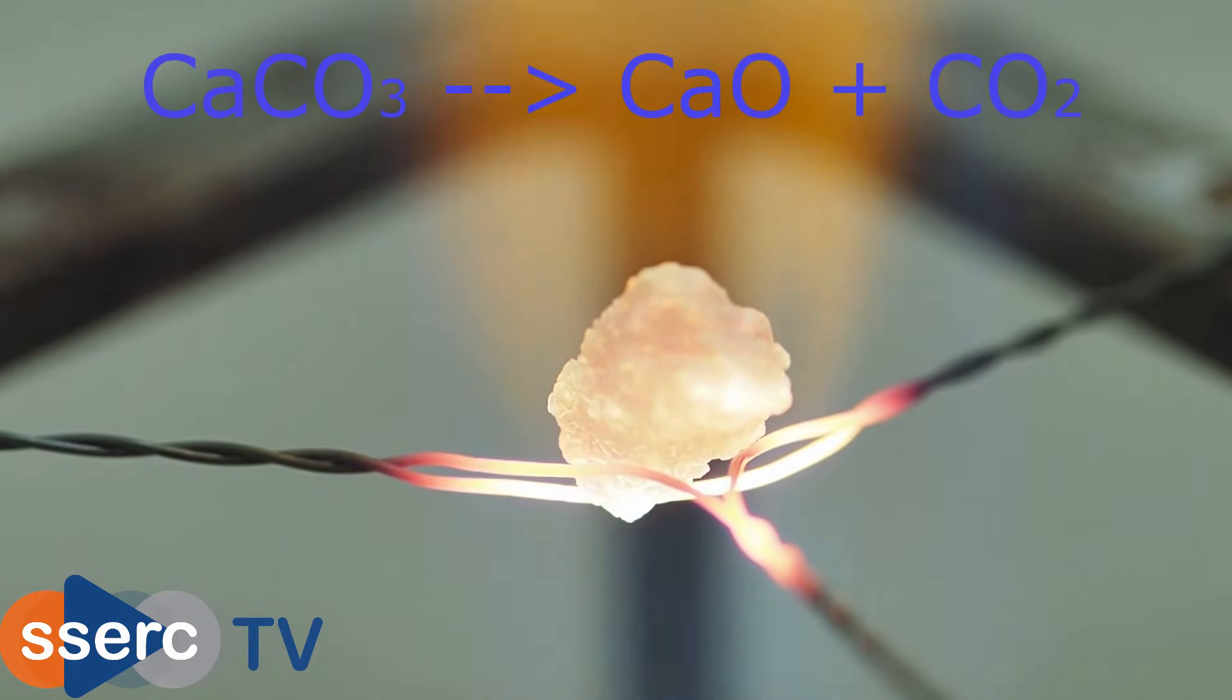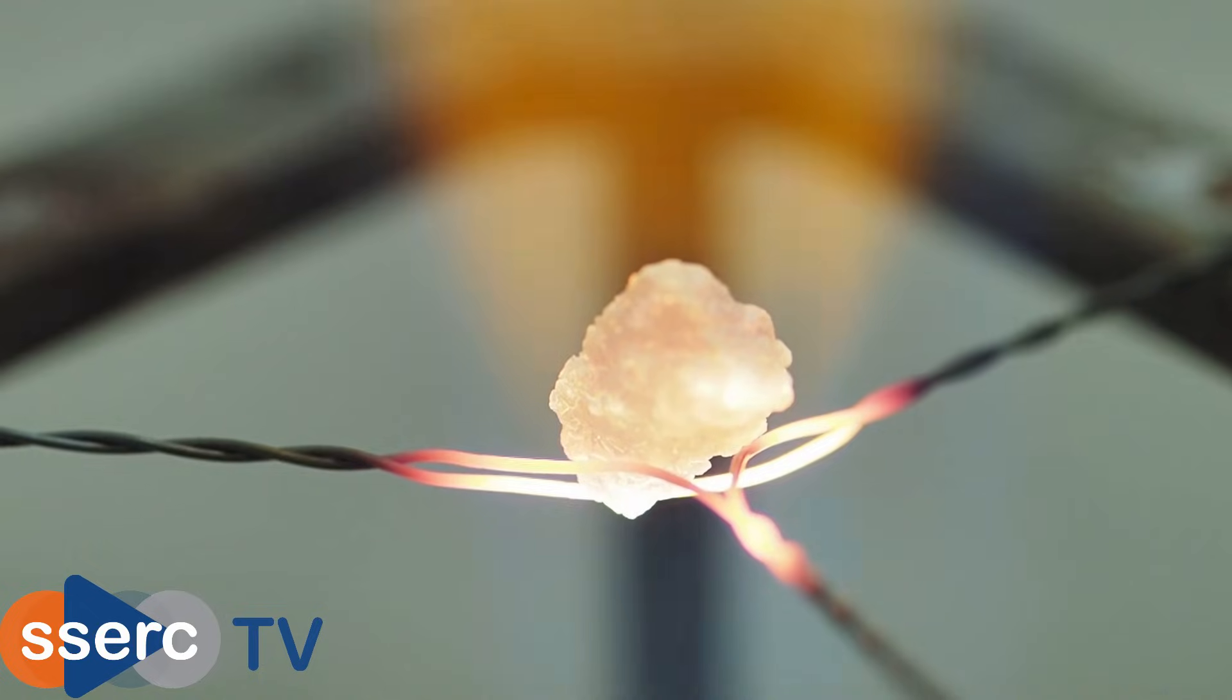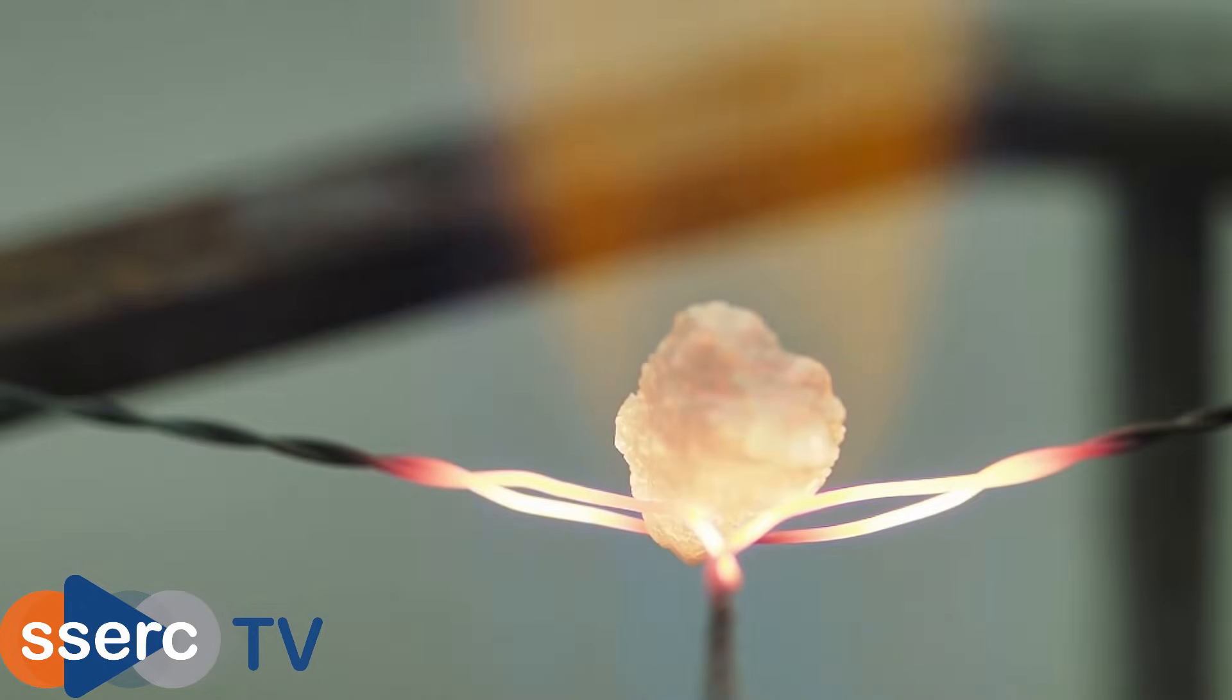The heat is causing the calcium carbonate to decompose and it's producing calcium oxide, this used to be known as lime. When heated strongly, lime gives off a bright white light and in fact this was used as an early form of artificial light in the theatre, and the word limelight is still in use today.